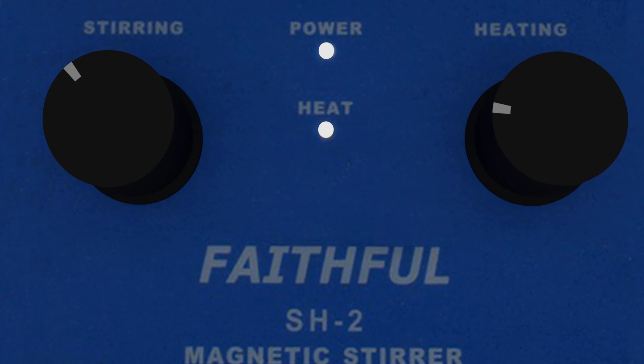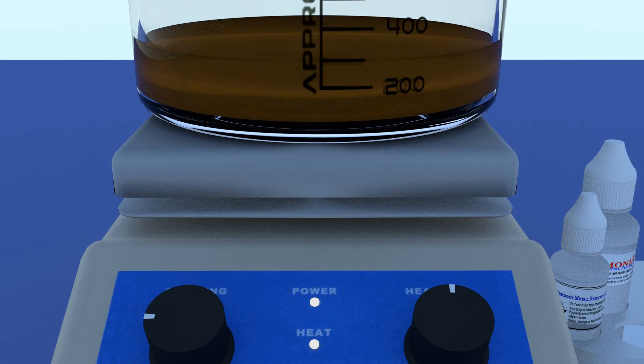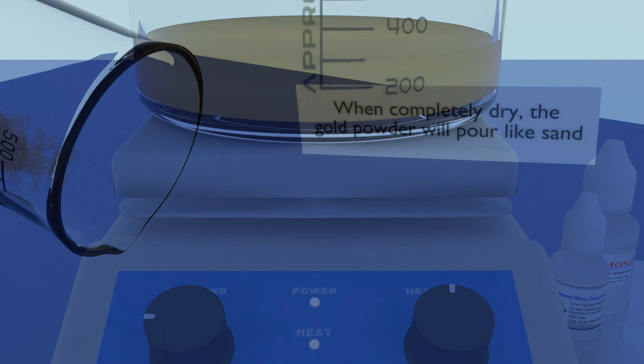To dry the gold mud, place the beaker on the hot plate and turn it on. Any distilled water overlaying and clinging to the gold mud will evaporate, leaving a dry brown gold powder that will pour out like sand.